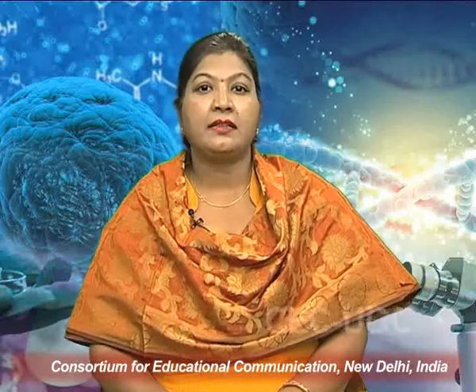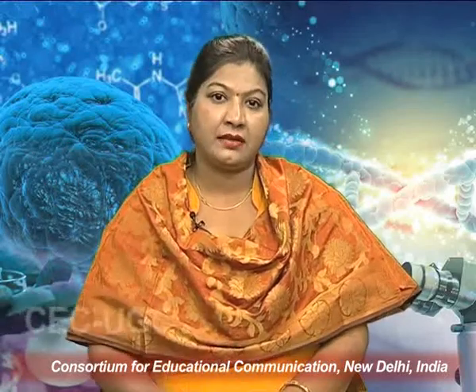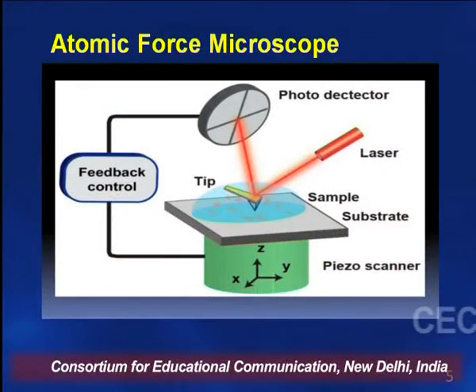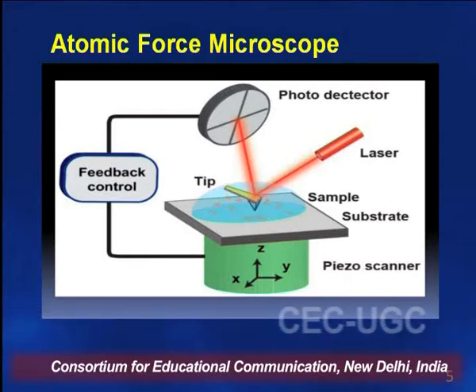First we discuss atomic force microscopy. Let me show you the diagram of how it works and what the parts behind it are. Now you see on the diagram that we are using a photo detector that is connected with the feedback control, and this feedback control is connected with the piezo scanner. On this piezo scanner there is a substrate, and this substrate holds the sample, means we deposit the sample on the substrate and then we can get its imaging by using the tip.